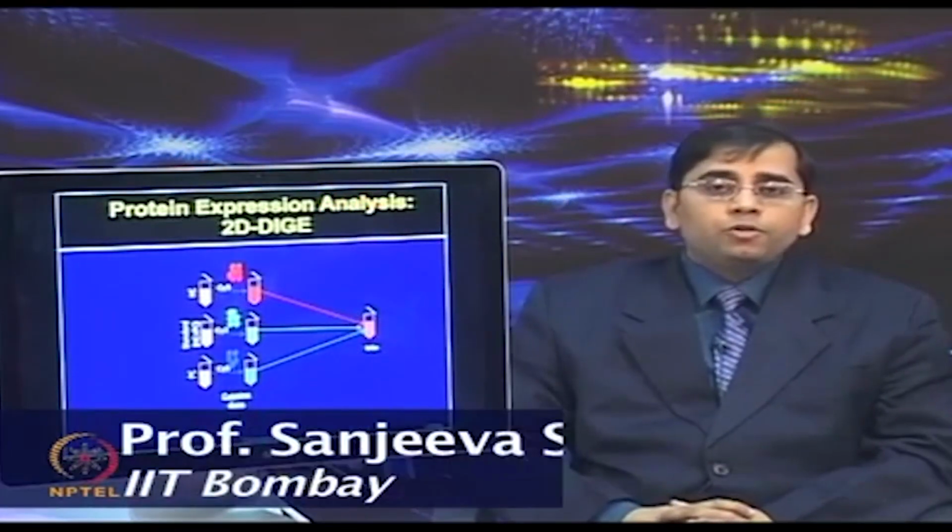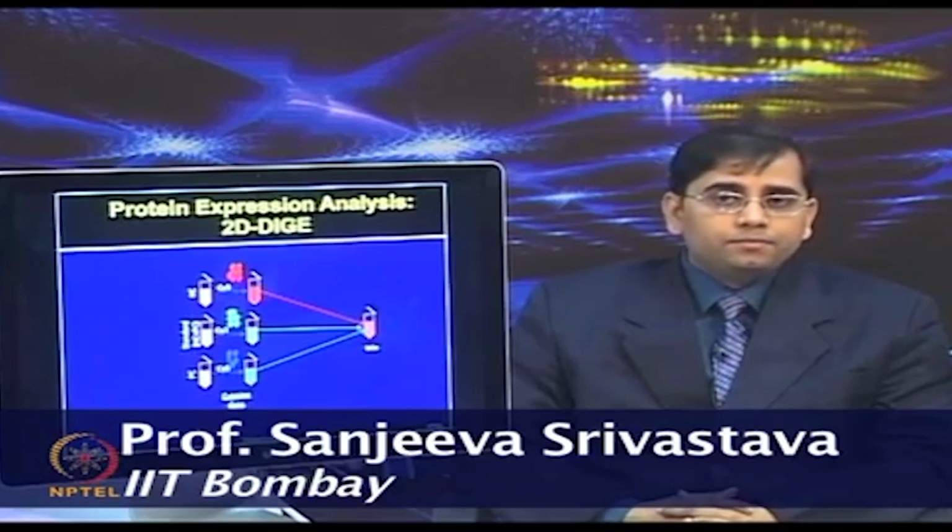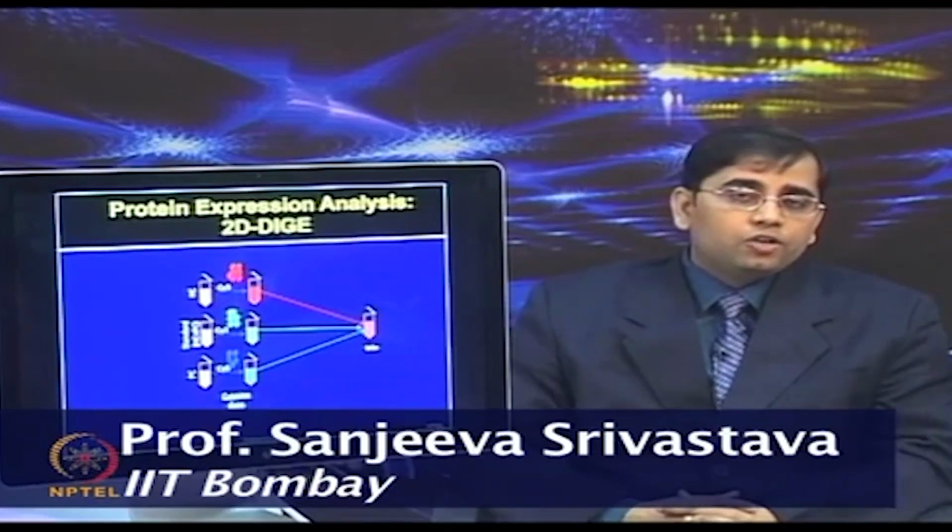The differential proteomic analysis was performed in two different cohorts of histologically confirmed prostate cancer with different grades of the disease.